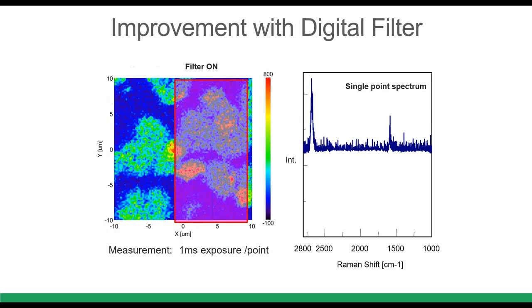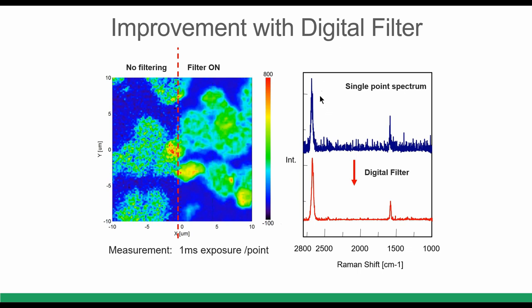This is an example showing the effect of the digital filter. We have the signal, the digital filter is applied, and we get a better spectrum. As a consequence, we can have a better image — that is the final goal, to reproduce a clean Raman image. The only way to achieve this is with a very clean spectrum. For mapping a large area quickly, challenges are overcome using EMCCD detectors, a high-speed stage, and software data processing such as the digital filter.